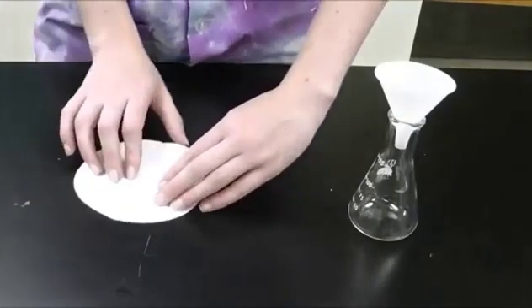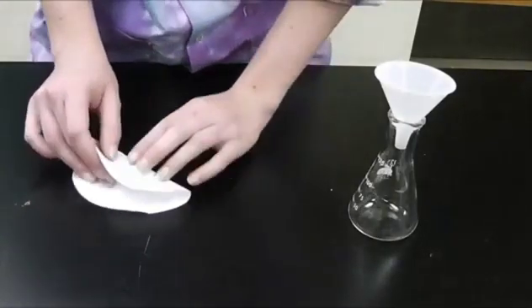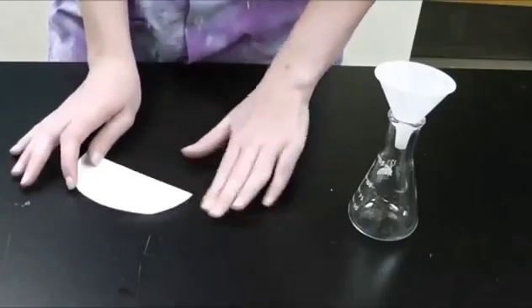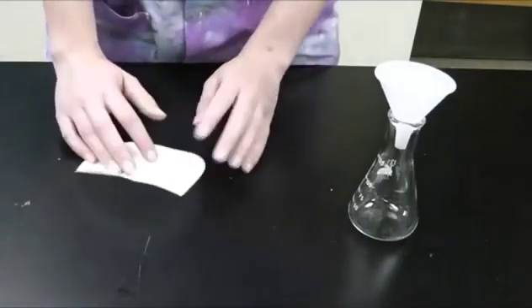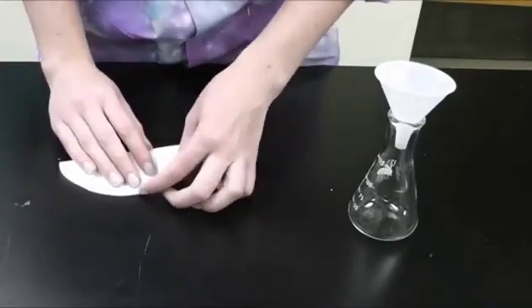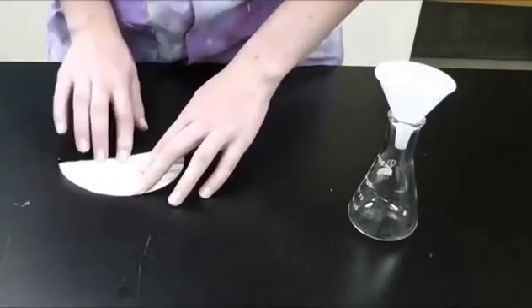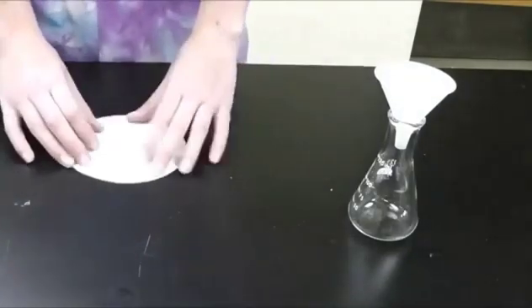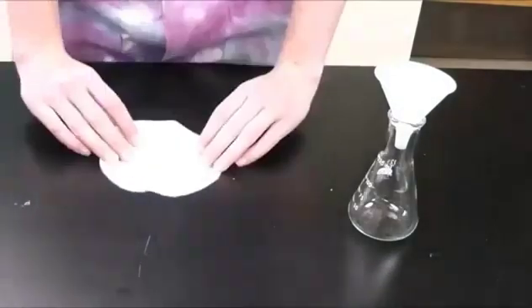Open it, rotate it 45 degrees, and fold it again, halfway between the existing folds. Open it, rotate it 90 degrees, and fold it once more. Your filter paper should now be divided into eighths.